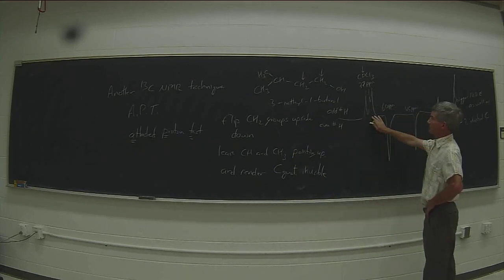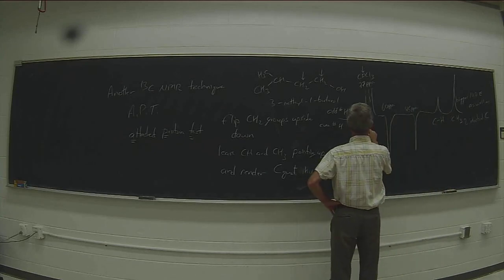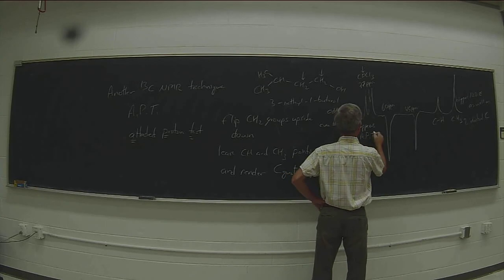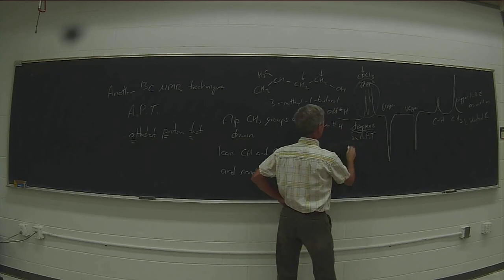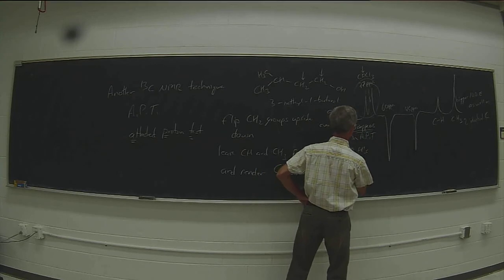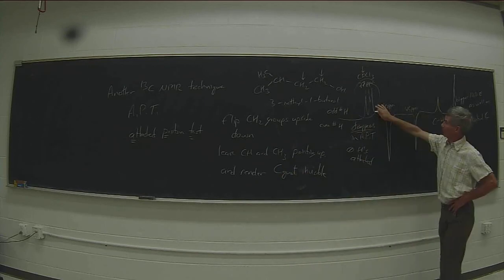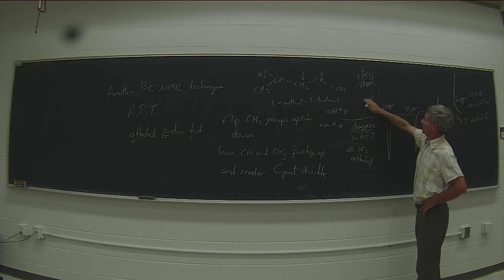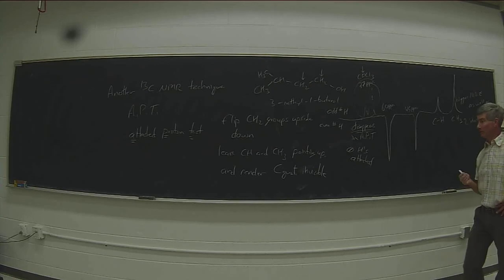And in the APT, our solvent peak at 77 ppm will actually disappear because there are 0 hydrogens attached. So the regular spectrum will have this peak, and the APT spectrum will no longer have that peak for the CDCl3, which is another way we can recognize that it was a solvent peak because it goes away.